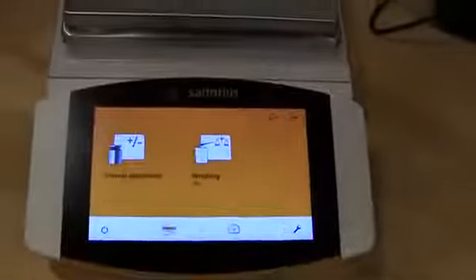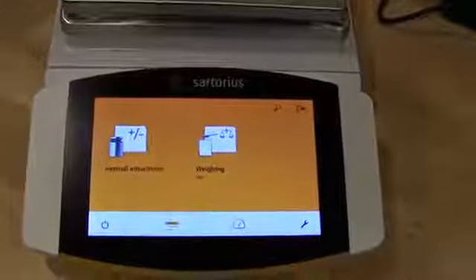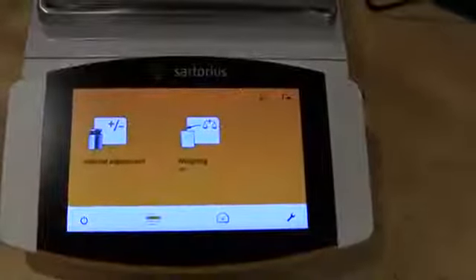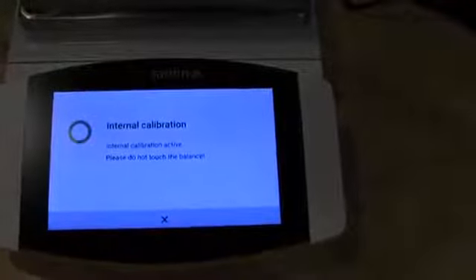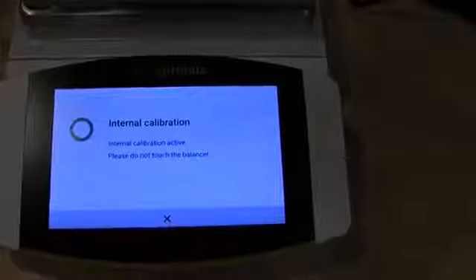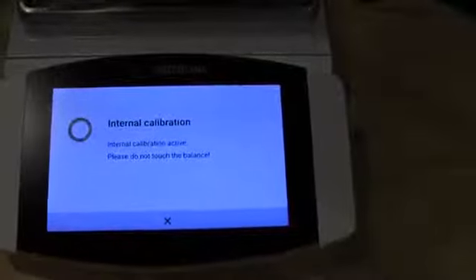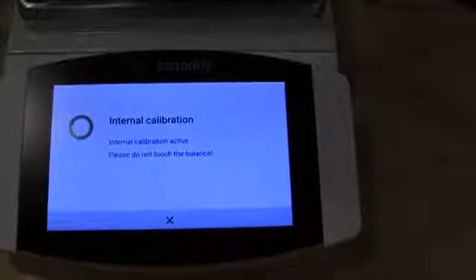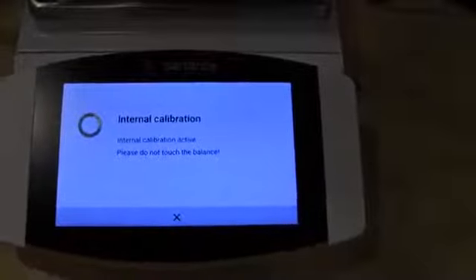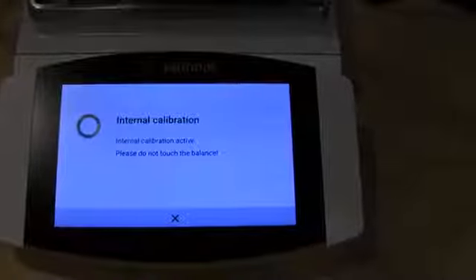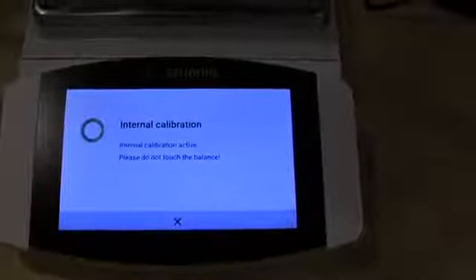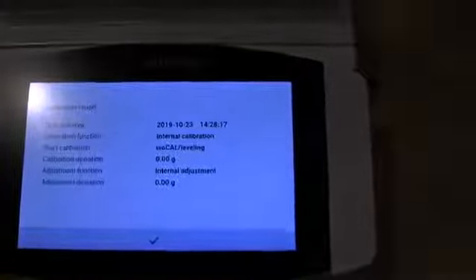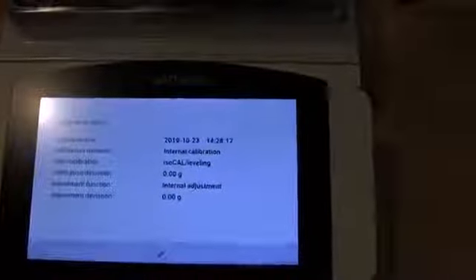This particular model has, well, they all have motorized internal calibration. Simply select internal cal and you'll see, maybe you hear that servo motor drop in the weight. It's doing the internal calibration. And there you go. You can see there from the last calibration the adjustment was zero. It shows you the date and time.